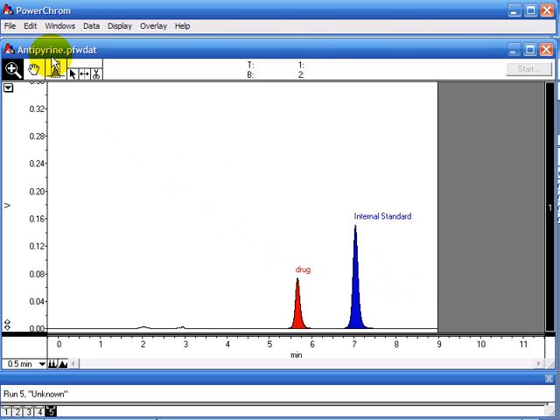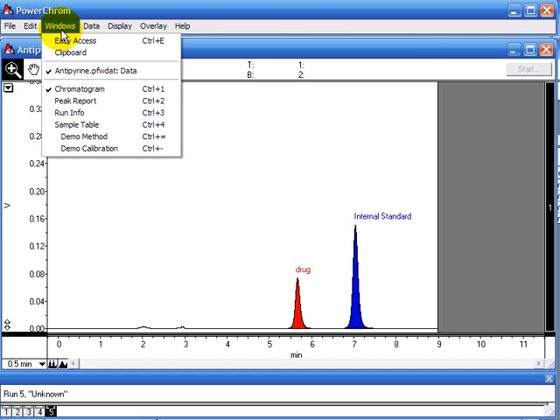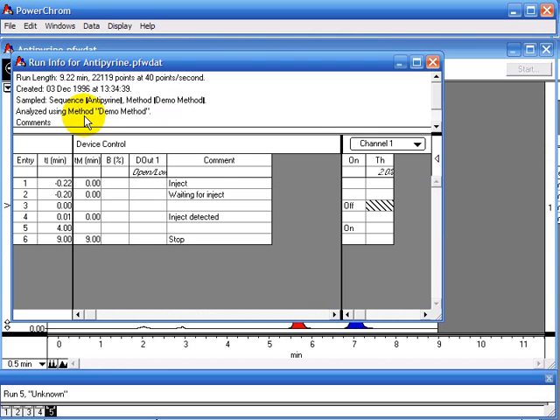You first need to know what sampling rate this data was collected at. You do that in the Windows menu, Run Info. It says here that the data was collected at 40 points per second. That will come in useful later on.